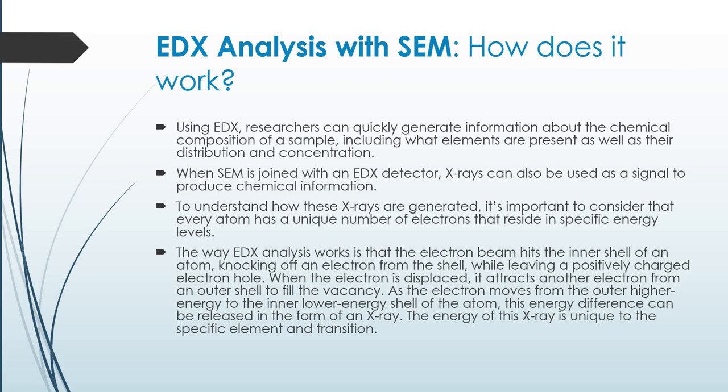Next is EDS analysis with SEM. From searching for food contaminants to identifying machine malfunctions to predicting how an aircraft part will corrode over time, energy dispersive X-ray analysis is a widely employed technique in today's material science, used together with a scanning electron microscope.